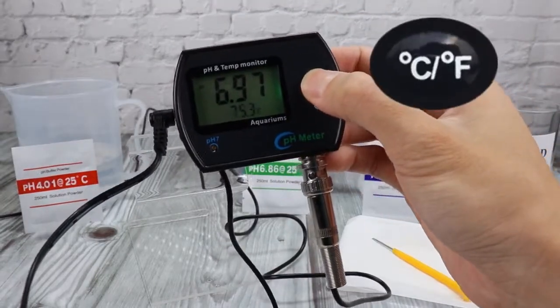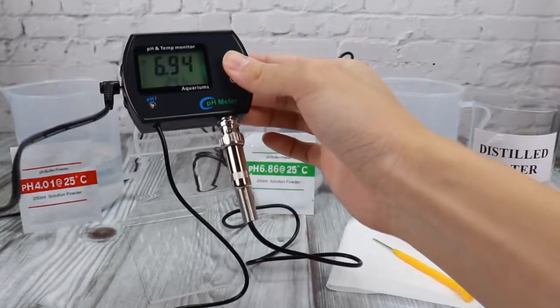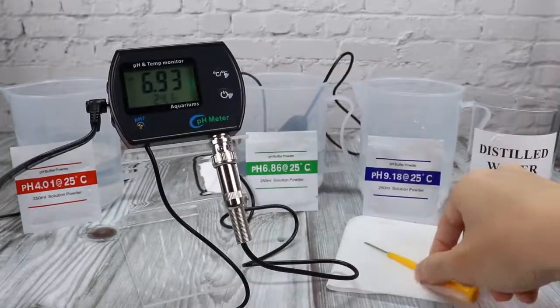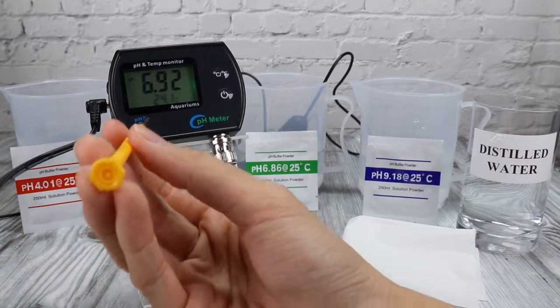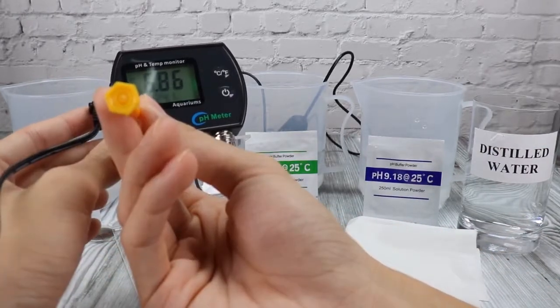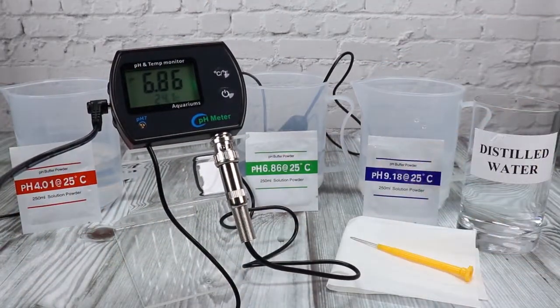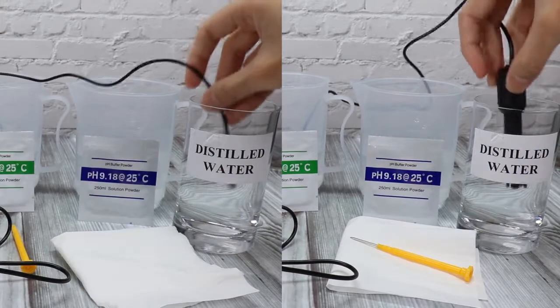You can change the temperature unit by pressing this button. Once the reading is stable, turn the calibration trimmer until the display shows 6.86. Please note that it is acceptable if the display value is within the error range.